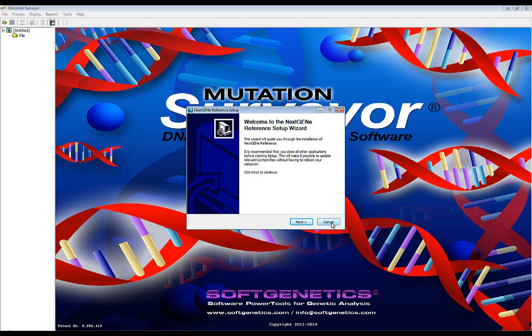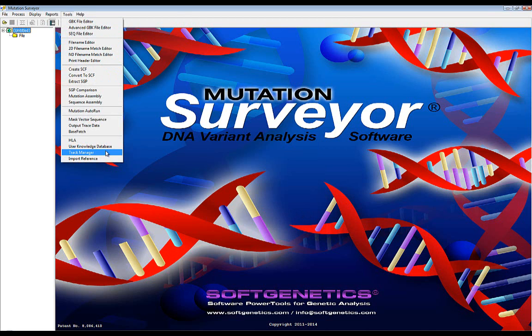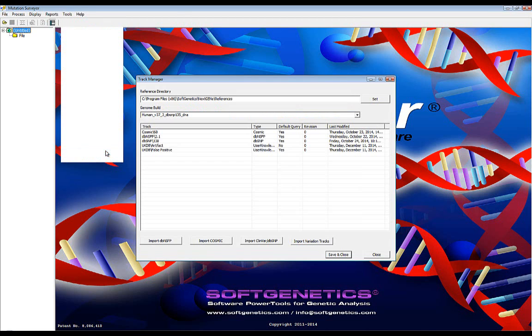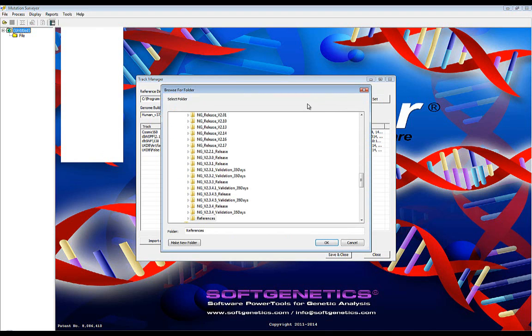After the reference has been downloaded, it can be imported into Mutation Surveyor by navigating to Tools, Track Manager. Here, you will be able to select a genome build and the annotation databases associated with that genome. To select the recently downloaded genome, click the Set button at the right and navigate to the directory that contains the reference.